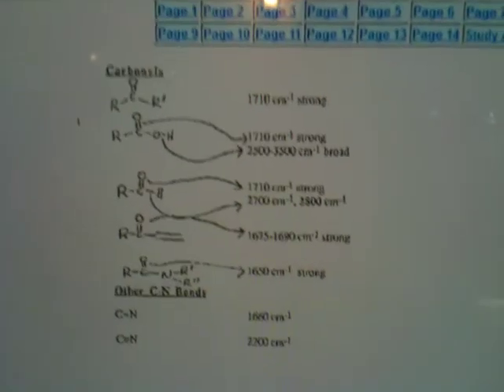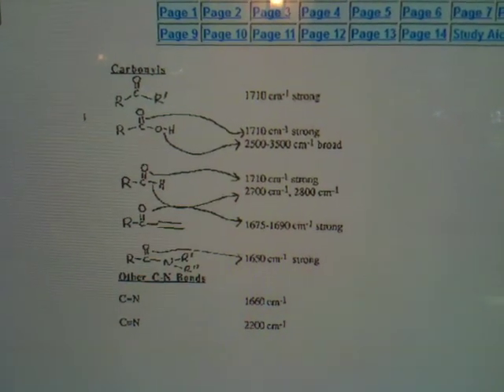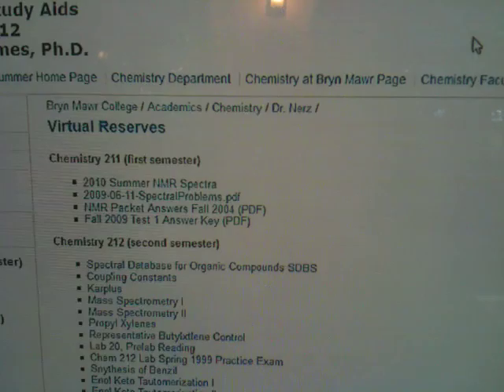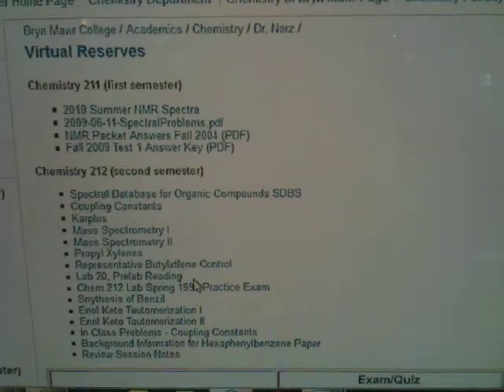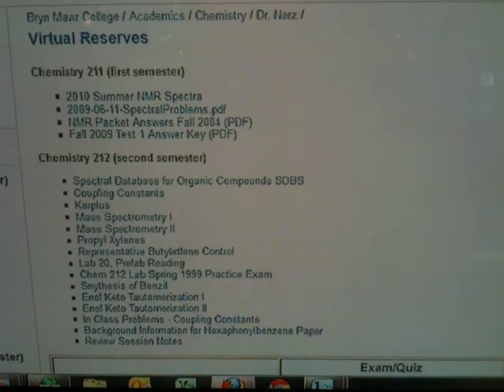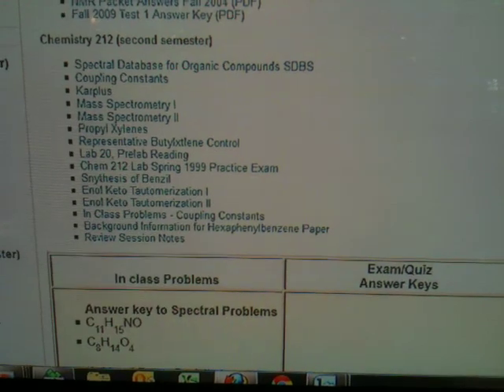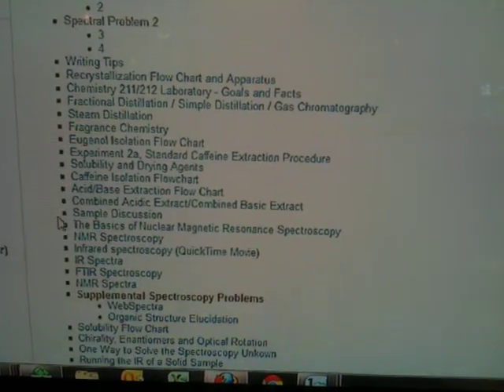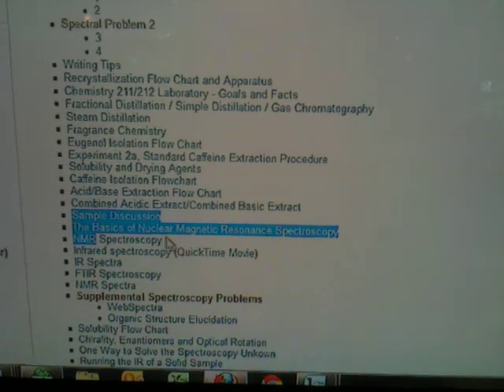The approach I take with infrared spectroscopy is what I call a landscape approach. So what I'm going to do is call up some spectra that I like to use for this. And we're going to just start looking at spectra. But before I do, I'm going to put them up, and you can see what a real spectrum looks like just for a second here. We have a wonderful spectral database. But before I end, I'll try to show you that as well, where that is.